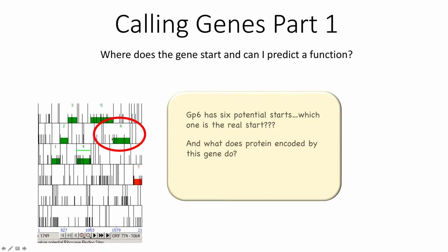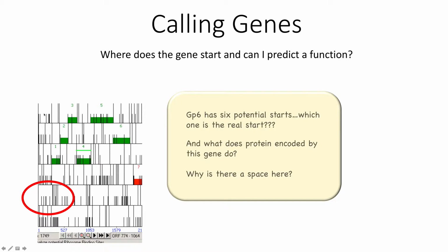Our other job is to look at what the protein encoded by this gene possibly does. What is its possible function? And finally, the other thing we're going to do is look into places in the genome where an open reading frame has not been called.